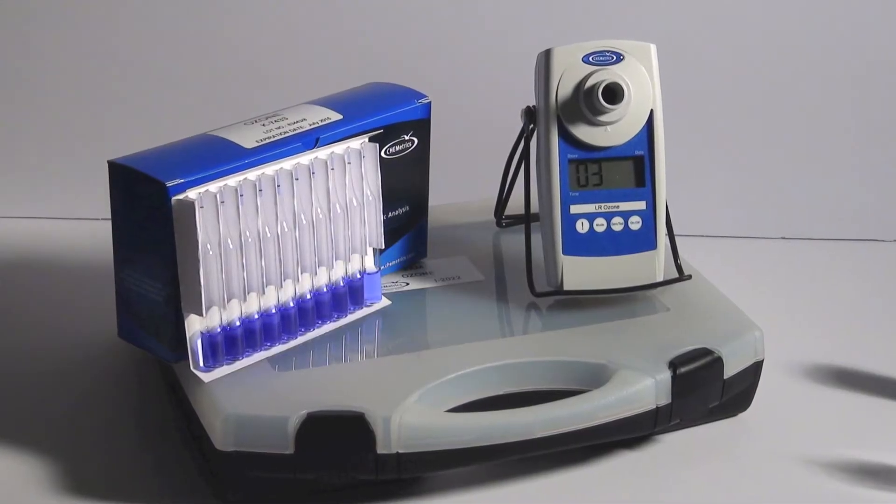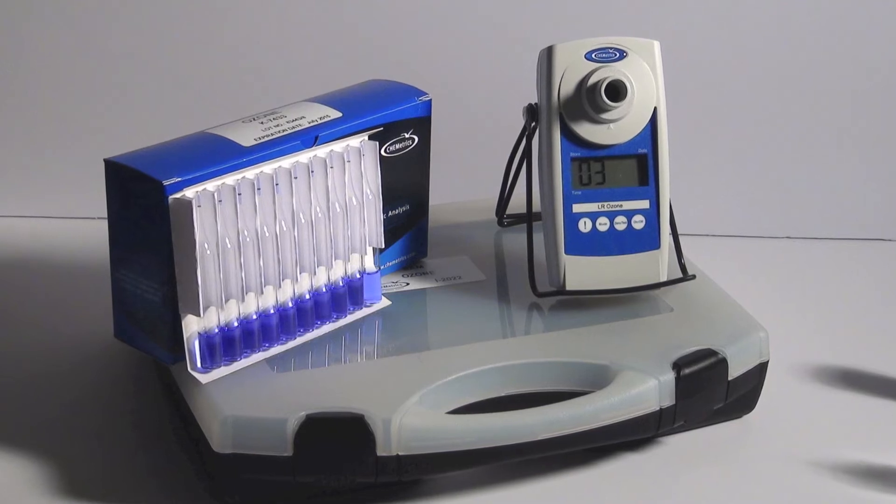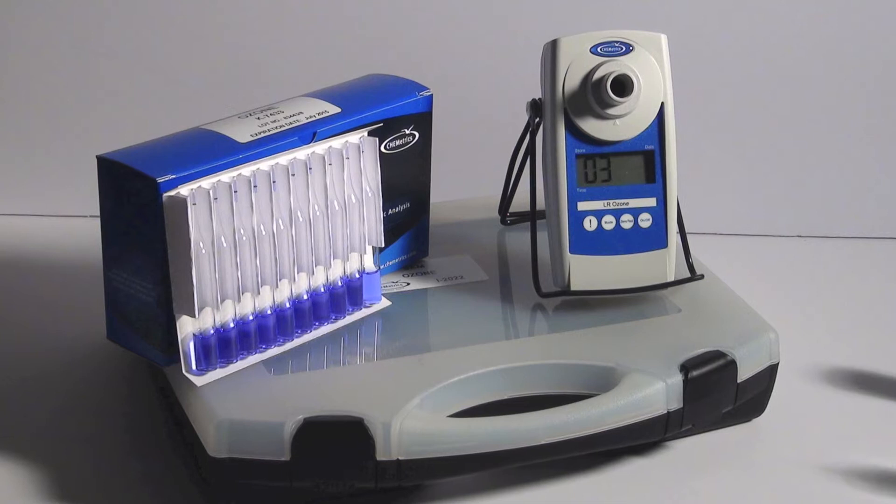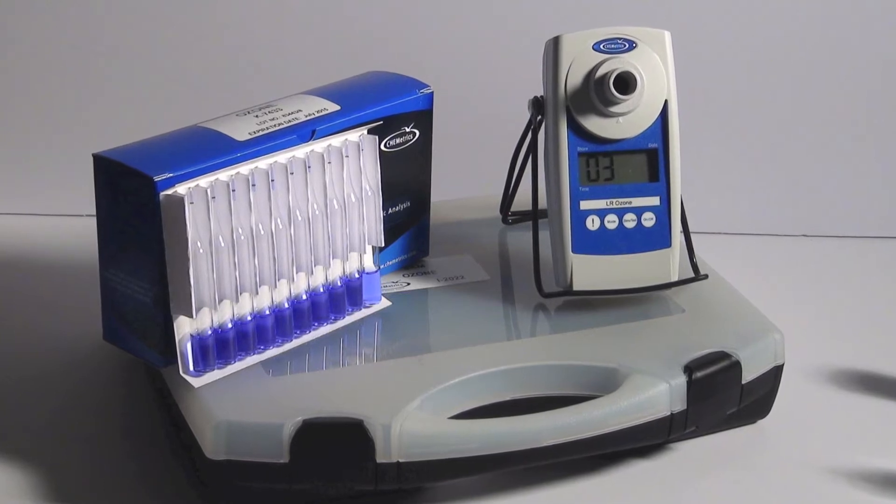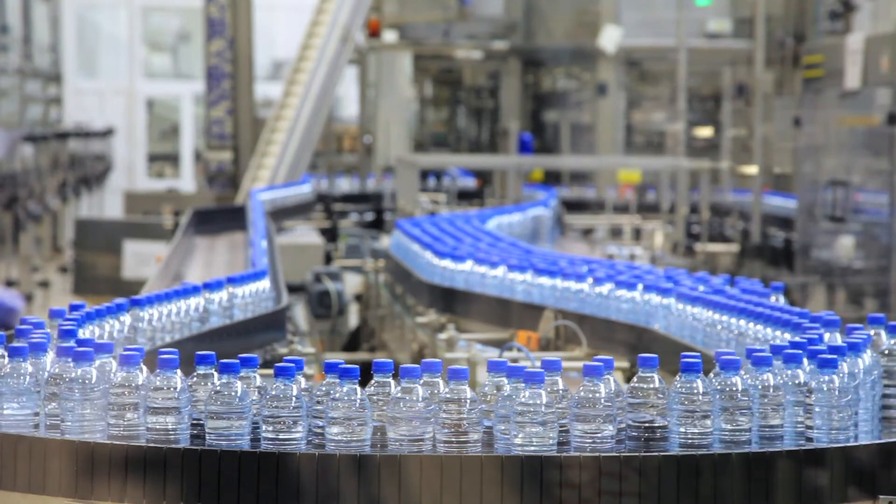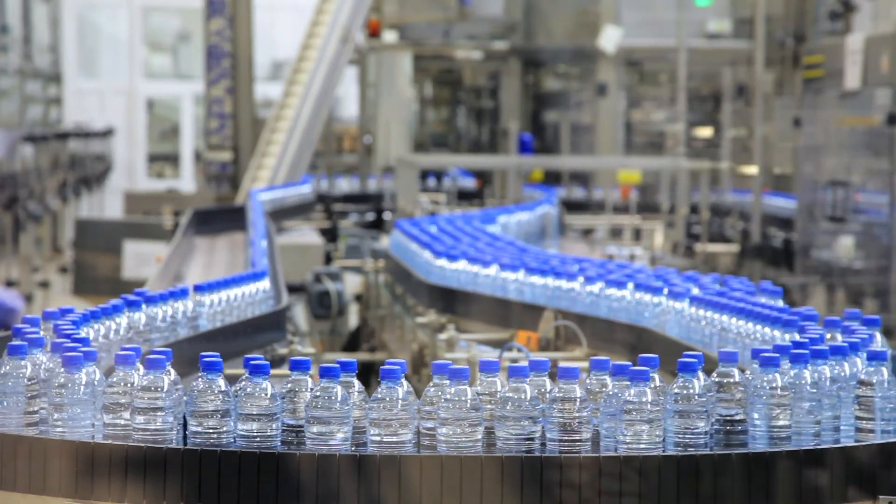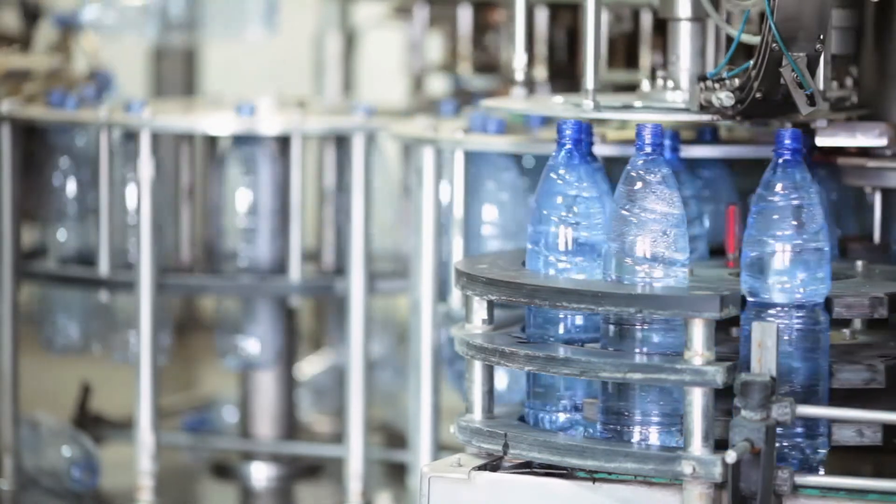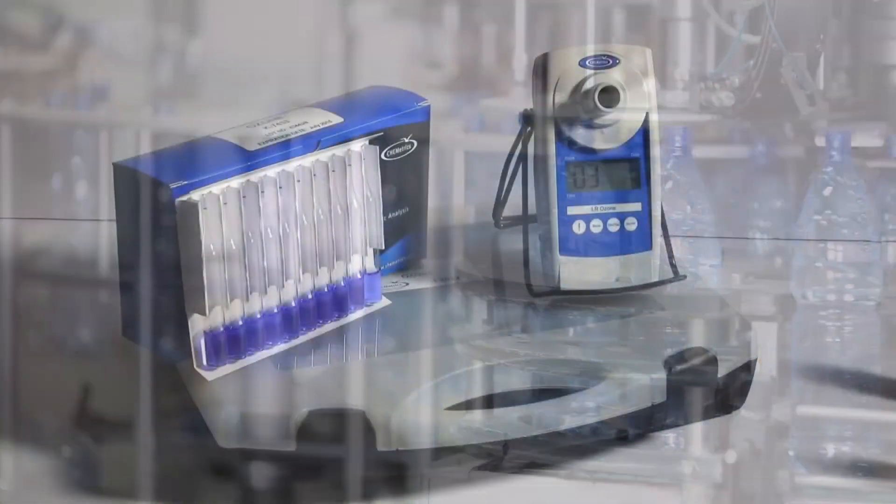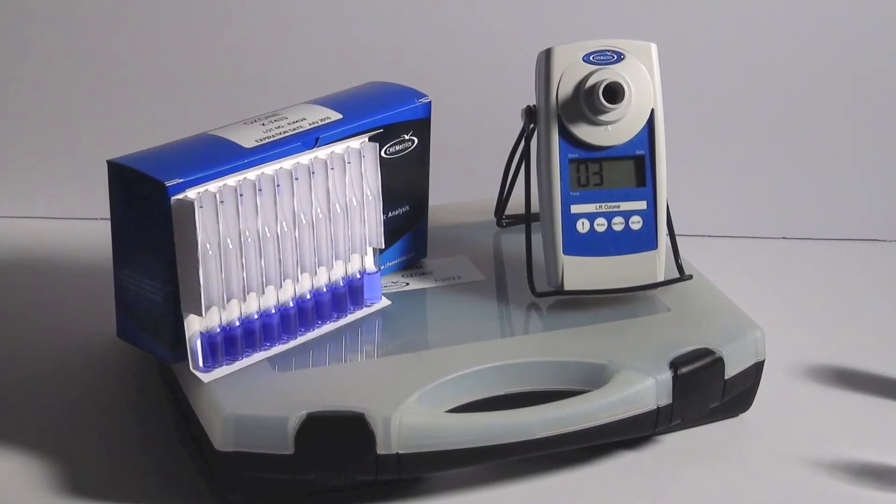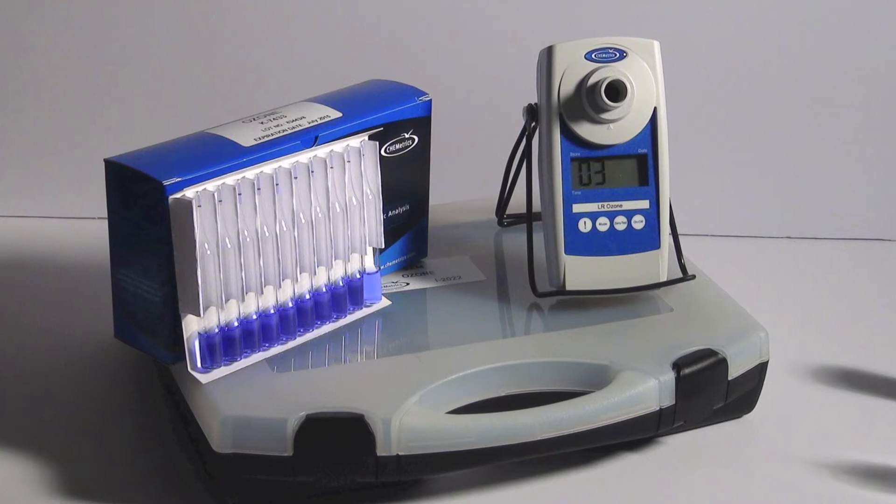Kemetrik's K-7433 Ozone Vacuvials Test Kit employs the broadly accepted indigo colorimetric chemistry packaged in vacuum-sealed self-filling ampoules. Designed to quickly and accurately measure ozone levels following disinfection treatment, the kit meets FDA control point requirements for bottled water and features an innovative self-zeroing technology that eliminates the need to generate a reagent blank using only one ampoule per test.